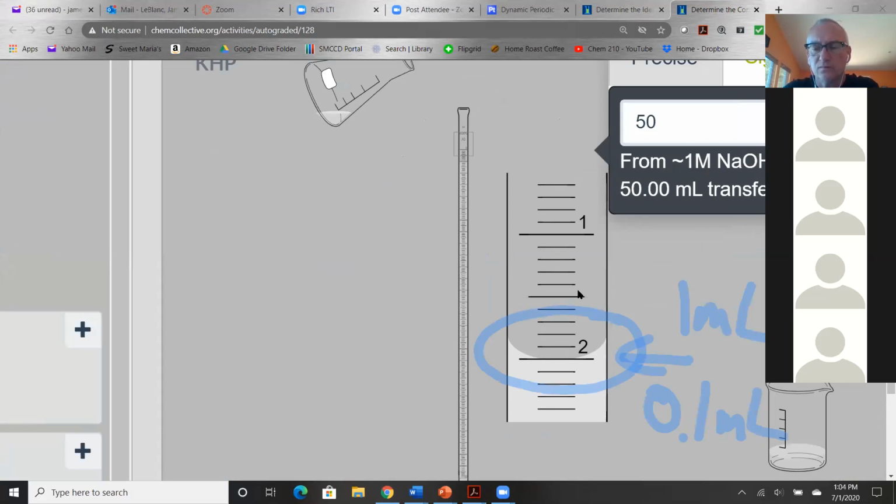2 milliliters? Nope. Or is it 20? It's kind of hard. It is 2, but you're not saying it correctly. 2 milliliters. I would not say that that is 2. 2.0 milliliters? Or I'd say it's 2.1? More accurate than that. 2.1 ml. No, 2.1 would be right there. That's 2.1. 2.00 milliliters. There you go. Yeah, it is right on.